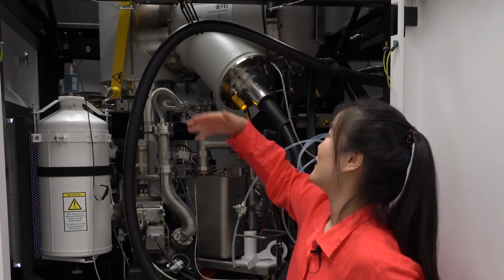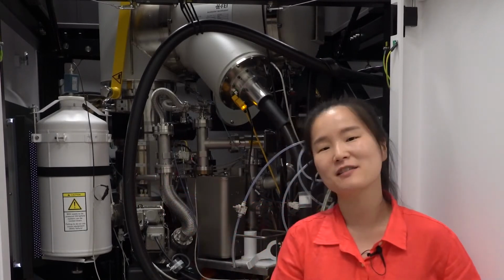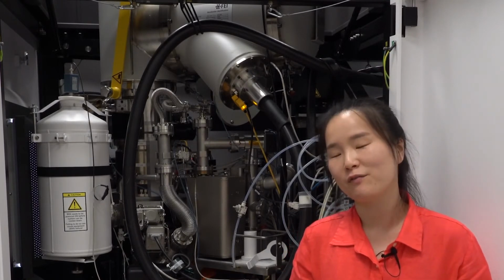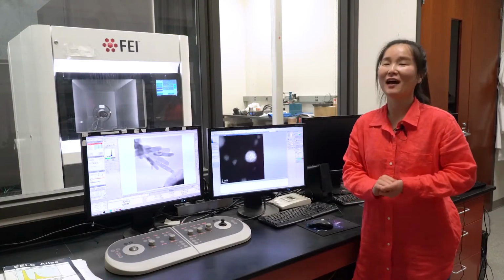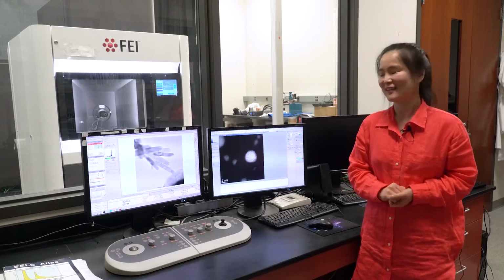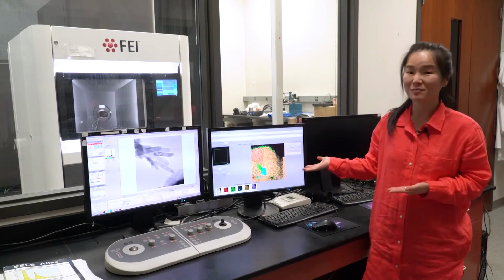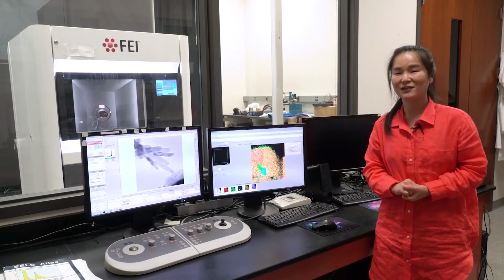The electron beam is generated at the top, and the electrons come down to the sample around here. The electrons interact with the sample, and various signals come out from these interactions. And we record these signals to characterize various properties of the nanomaterials. Let's see how the real image looks. The electron microscope allows us to see very tiny details like nanostructures and even atoms in a sample. Here we have an atomic image of platinum cobalt nanoparticles for catalysis. It also allows us to see the chemical compositions in the sample. Here we have materials composed of 5 different elements, and each color represents a different element.